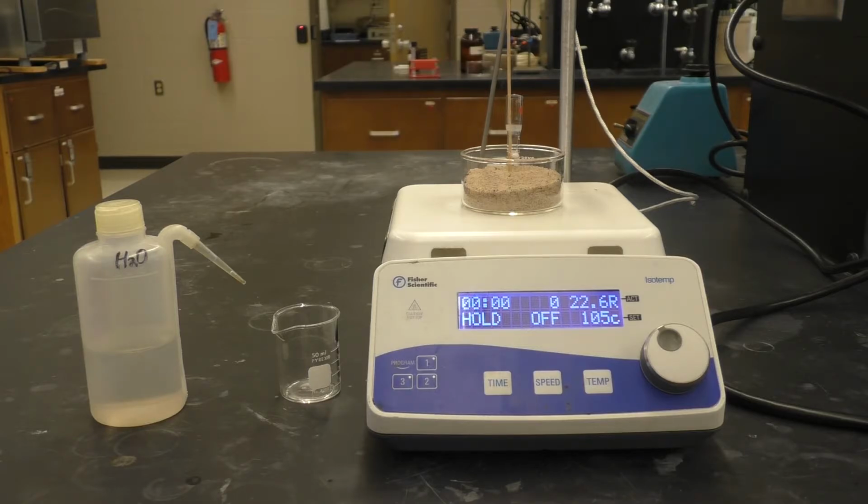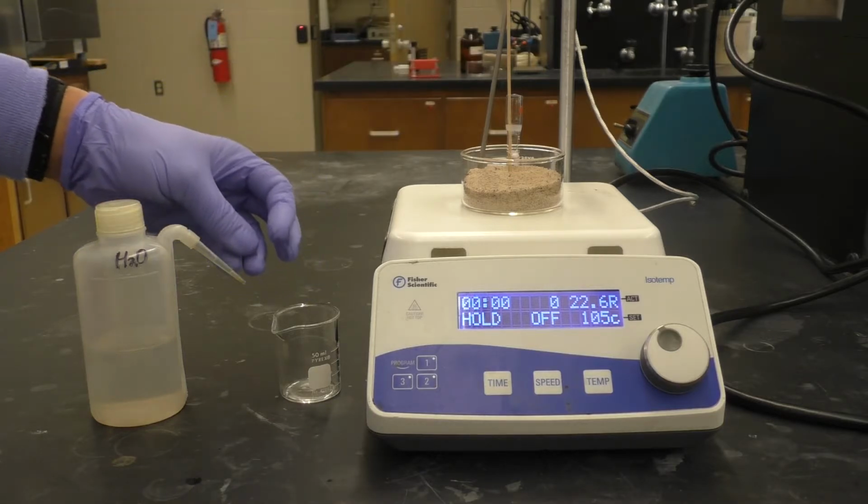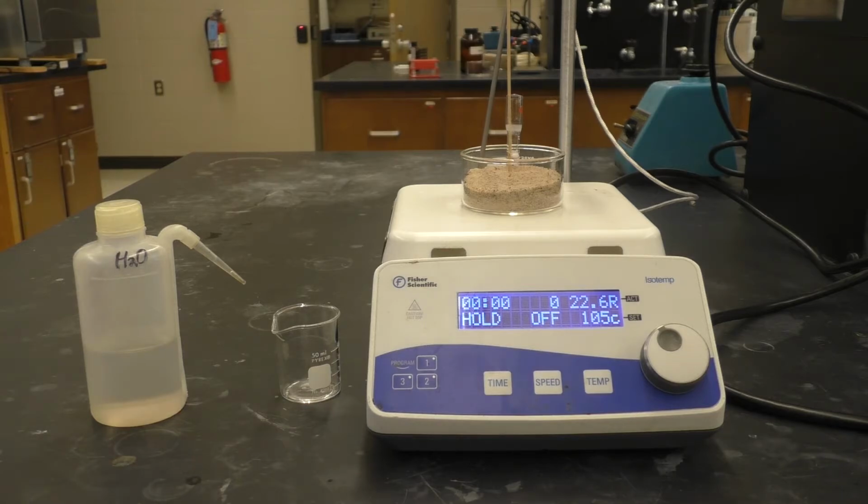Once all of the material is dissolved at the elevated temperature, then I will want to remove the Craig tube, let it cool. I can remove the boiling stick as well. Let that cool down to room temperature. That should induce crystallization of the desired material and hopefully leave the impurity behind, still soluble in the solvent. And then from there, I'll be able to filter and collect my material. Let's start.